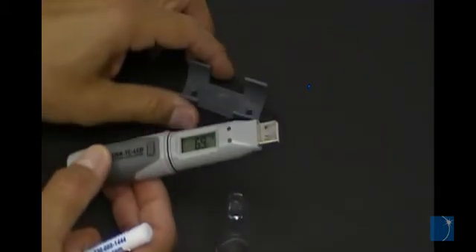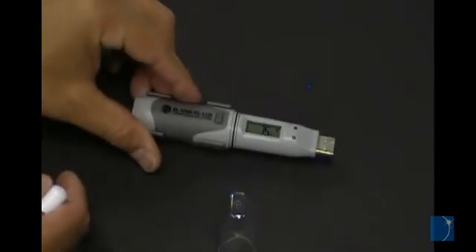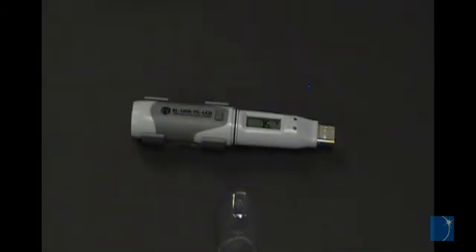Most ELUSB-1 series loggers also include a bracket for mounting. For more on setup and configuration, click the Details tab on the product page.